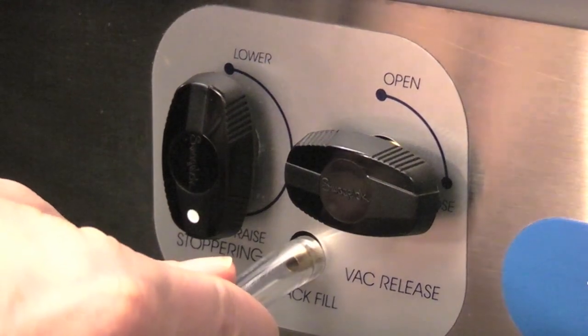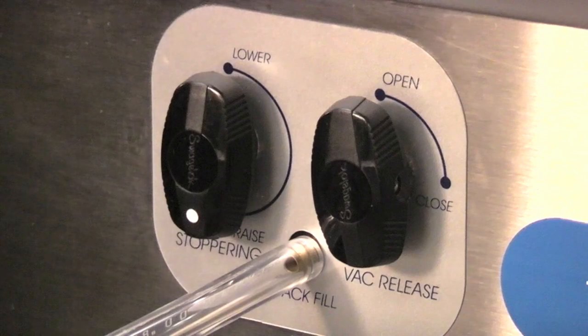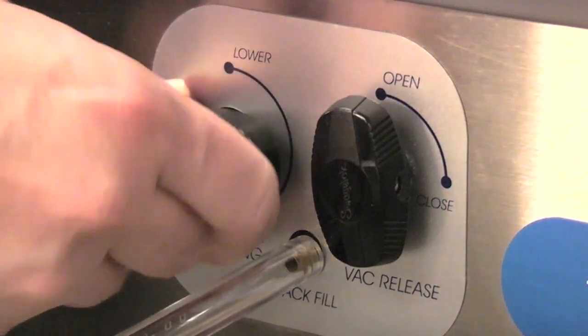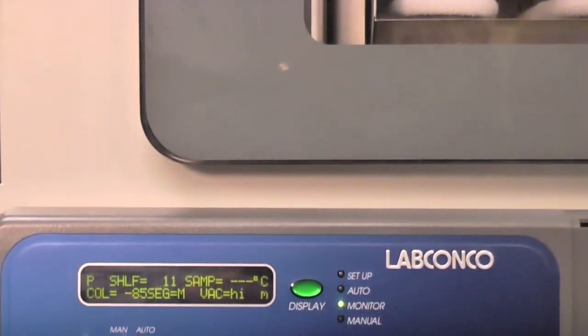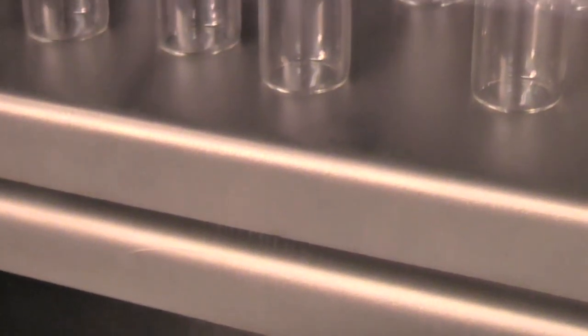To backfill the chamber with a gas, connect a cylinder of the desired gas to the backfill port. Allow the vacuum pump to run for a few minutes while the gas enters to permit the backfill gas to surround the freeze-dried sample. When the vacuum pump is turned off, air will enter the system through the vacuum brake valve located between the vacuum pump and the collector chamber.